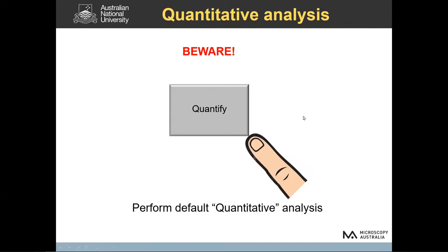I would argue that in many cases, it could be considered largely qualitative or semi-quantitative at best. So you just need to be very careful when you press that quantify button and know whether the system's properly calibrated.